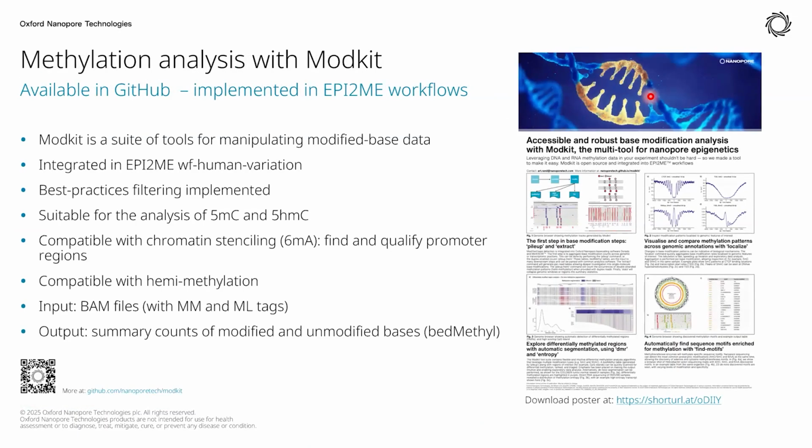Okay. And then one of the main standout features for Nanopore sequencing is that you can get this modified base information from your sample without doing any other sort of wet bench approaches like bisulfite sequencing approaches. These are all just there in your raw data, whether you base call them or not. So you can always go back and base call your raw data again, and then select a modified base model if you want to.